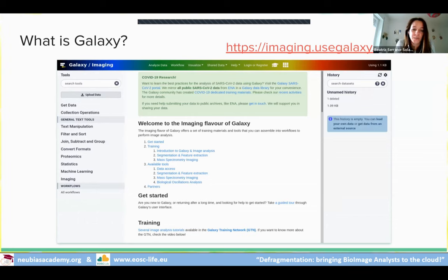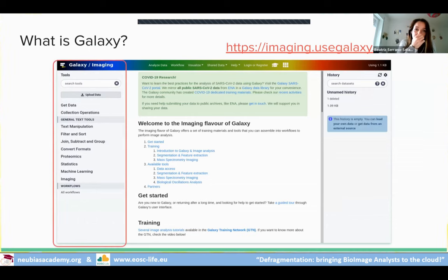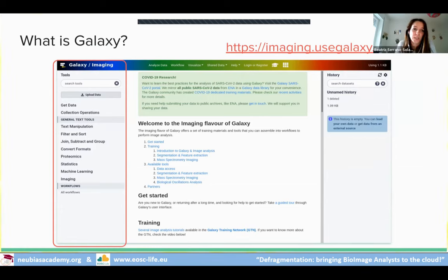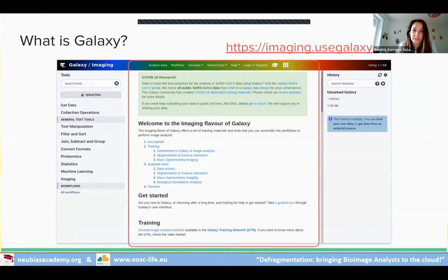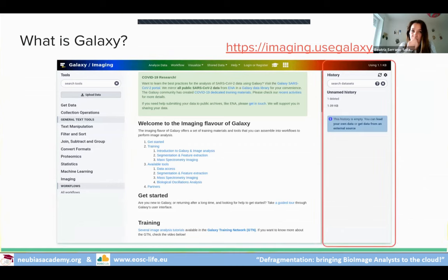Galaxy is a web-based computational workbench with a graphical user interface and a programmatic API for scripting and automation. In the browser it has three main panels: on the left, a set of tools with around 8,000 tools available; in the center, the working area; and on the right, datasets and operations in order of execution — like a live documentation of processing steps, similar to a lab notebook.